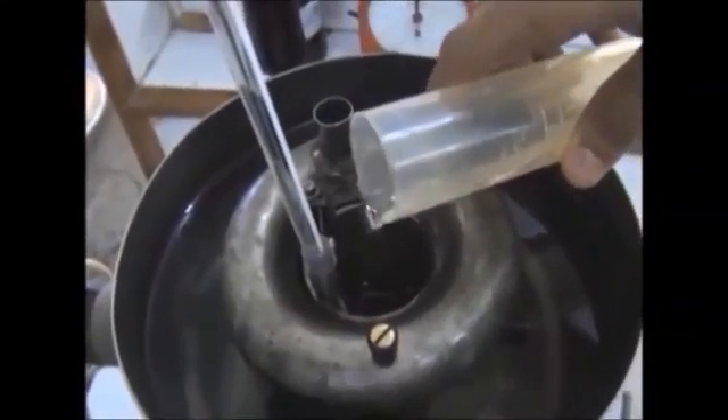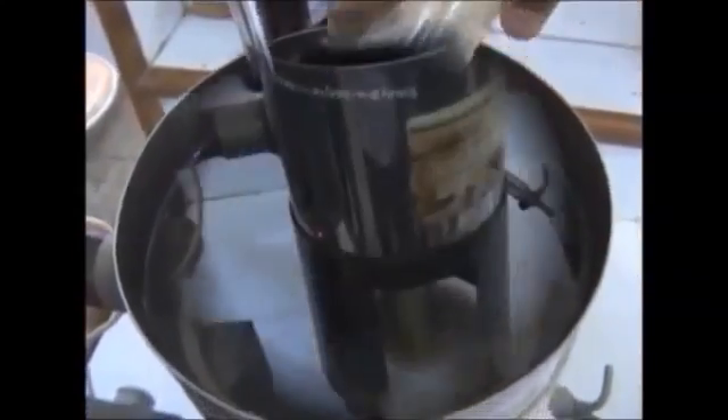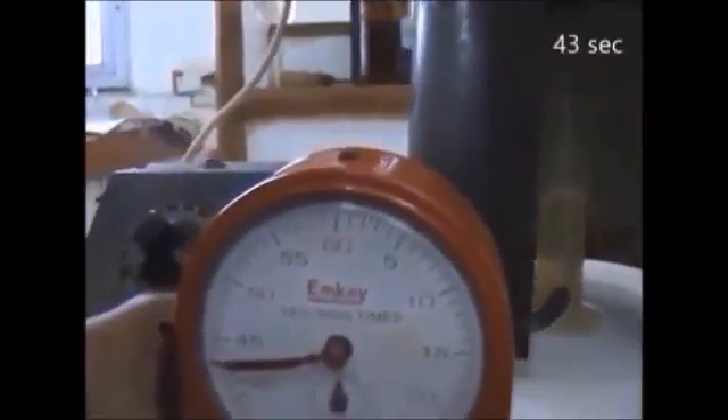Let's begin with the first part. Filling the glycerine into the vessel, we start the heating. The first reading will be taken at 40 degrees. It is important to stir the water while heating. As soon as the thermometer reads 40, the stopper should be taken out and simultaneously we need to start the stopwatch to measure the time it takes to fill the cylinder with 50 ml of the lubricant. Our first observation is 43 seconds.